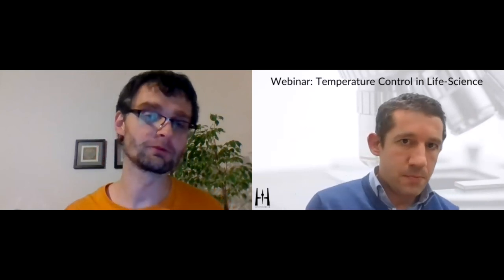Yeah, no one is doing that because, you know, there is no live cell imaging. With fixed cells, you can use antibodies, and that's it. But for live cell imaging, attaching labels would probably involve some genetic manipulation, which is also not trivial in these systems. It's not E. coli, right? We have genetic systems, we can do some things, but not very sophisticated ones, like introducing tags or something like that. So that's one possibility.